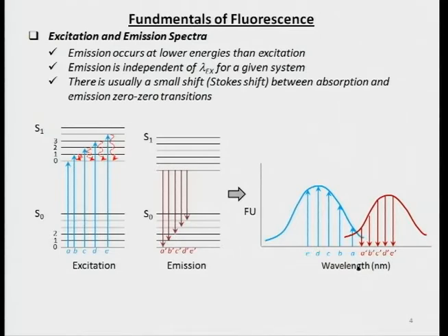By the time fluorescence occurs, there might actually be a small change in the levels of S1. So in addition to the regular case where all of this energy is lost, part of the energy is lost when it comes down, because of this change, so that you end up with a fluorescence spectrum where these energies are always less than these energies.